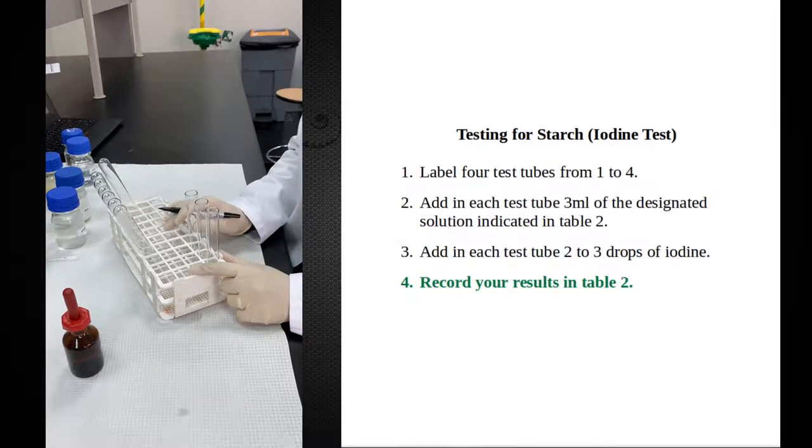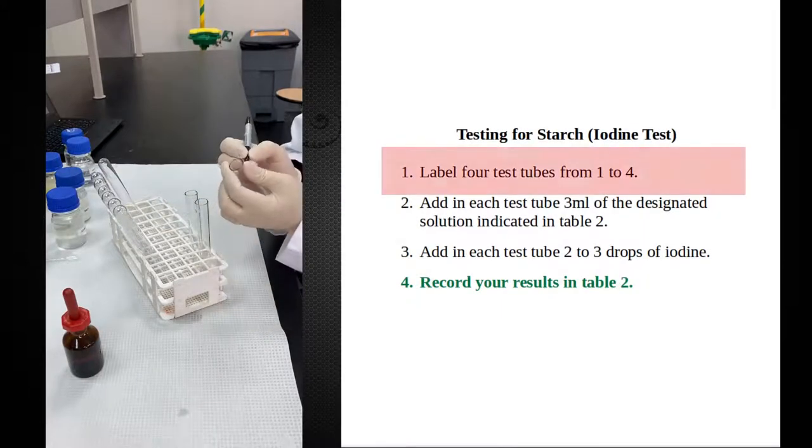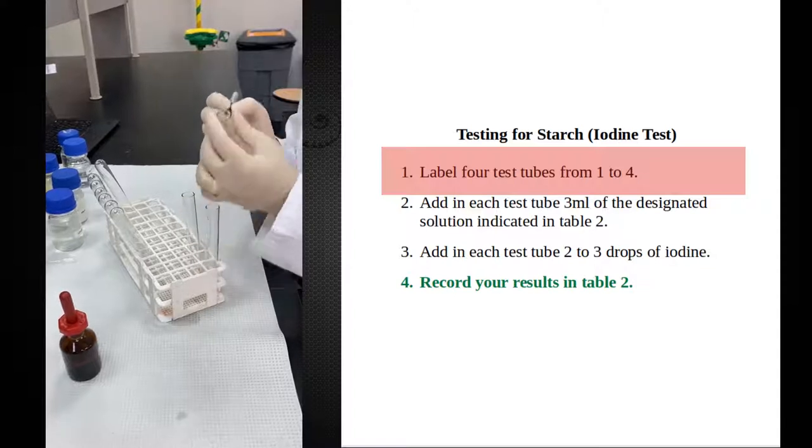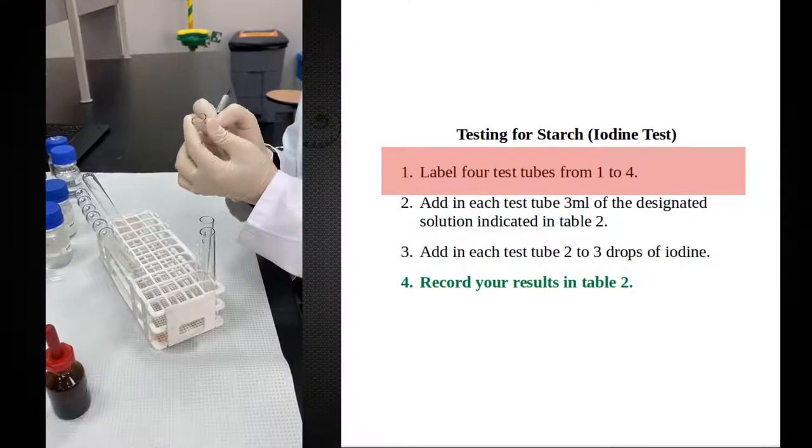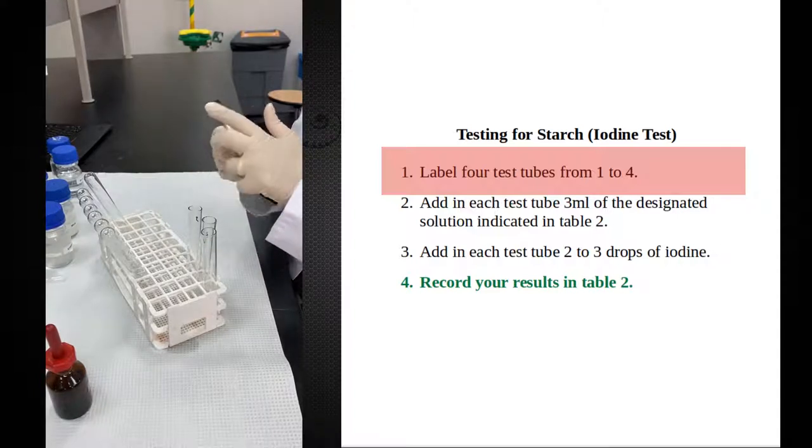This is now iodine test. Again, I will show you the test for three test tubes. I label my test tubes one, two, three. If you have more test tubes, you just label more test tubes.